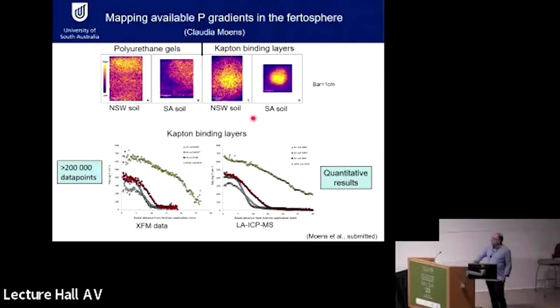In this case, instead of using the usual transect or virtual line scan, you can analyze where the center or the highest concentration is in your figure, and extract the radial distance, which means that you use all the points in the map. So you use 200,000 points in this case to generate those kinds of graphs.